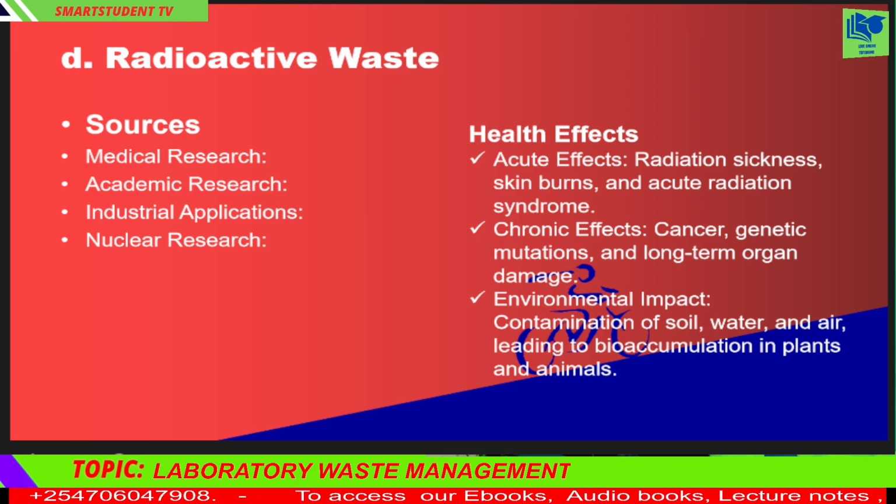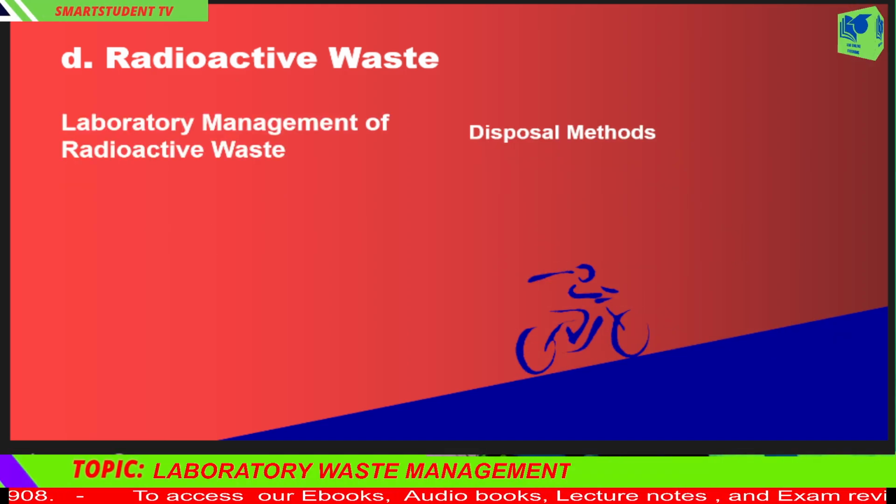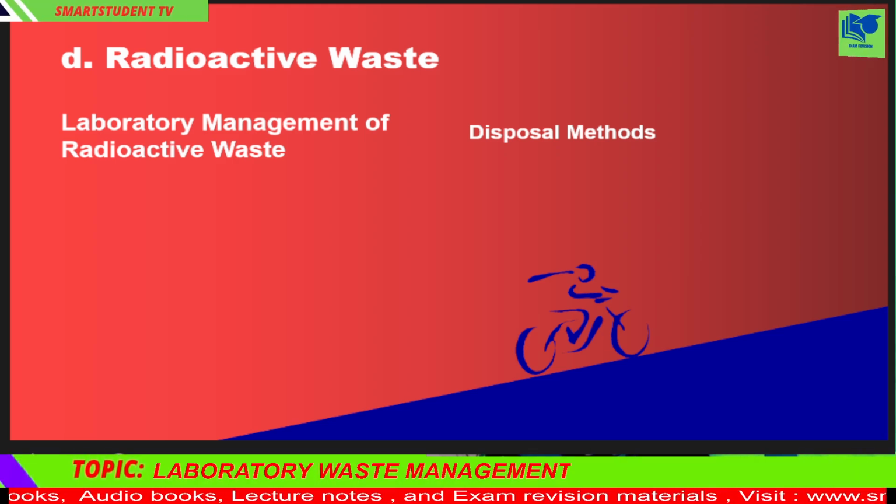5. Laboratory management of radioactive waste. Proper management of radioactive waste in laboratories is essential to prevent exposure and environmental contamination. Key practices include: 1. Segregation.